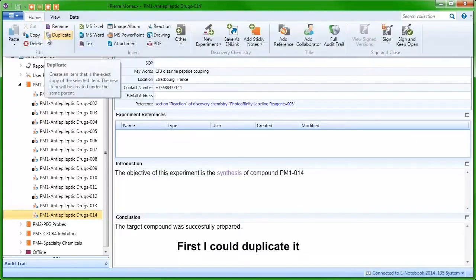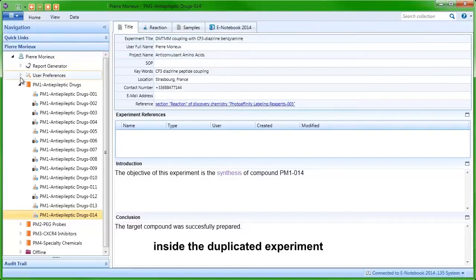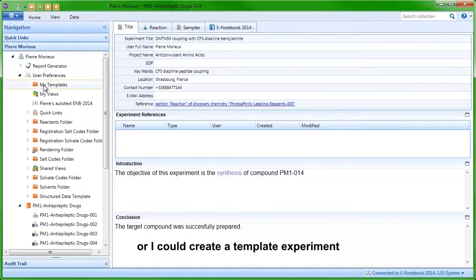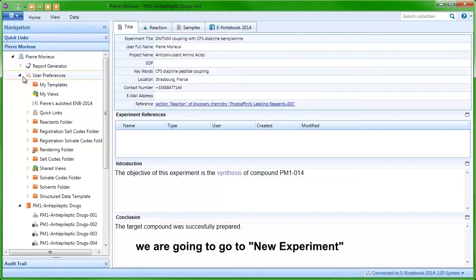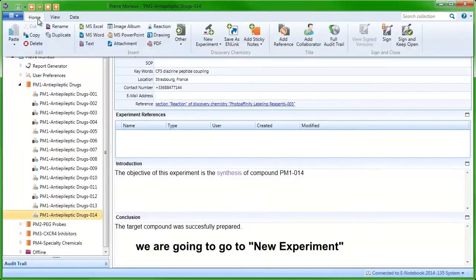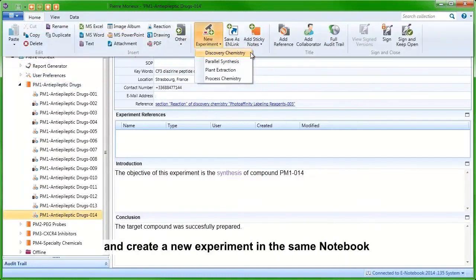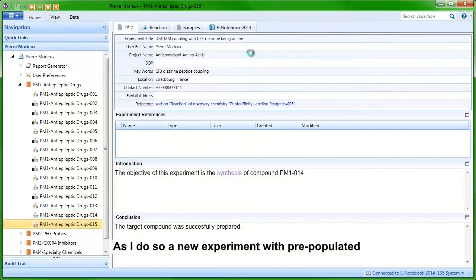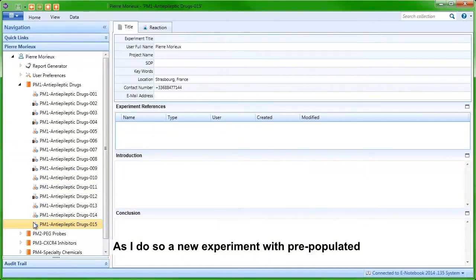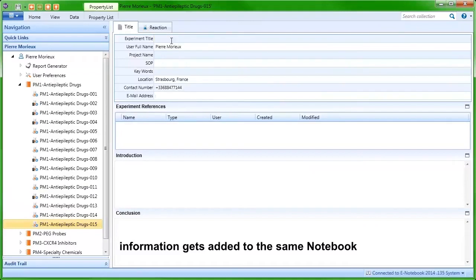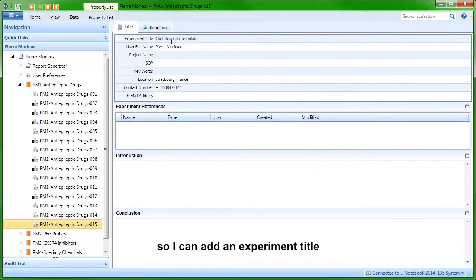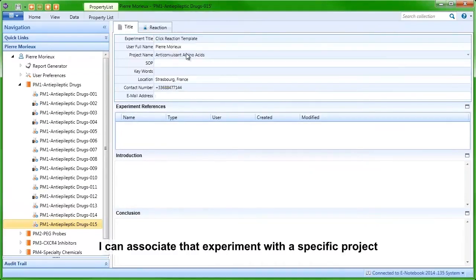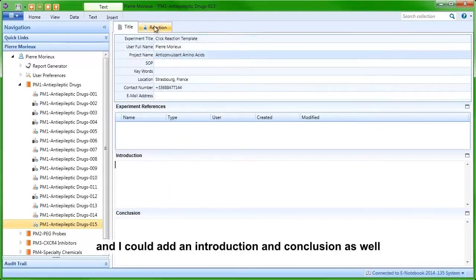First, I could duplicate it and then just change the different masses inside the duplicated experiment, or I could create a template experiment in the folder called 'My Templates'. To show you how to do that, we are going to go to New Experiment and create a new experiment in the same notebook. As I do so, a new experiment with pre-populated information gets added, so I can add an experiment title, associate it with a specific project, and add an introduction and conclusion as well.